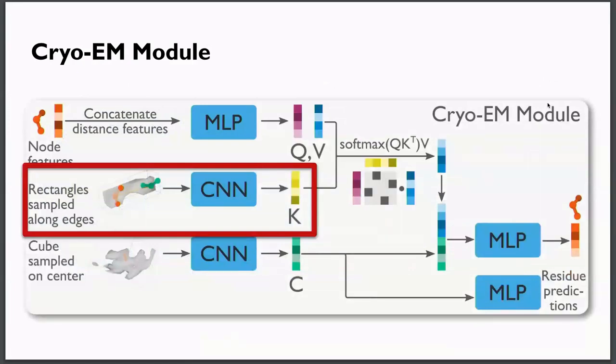And then we also want to know information about whether residues connect to each other or not, because just from the output of the segmentation, all you have is a bunch of nodes in space and you don't know what connects to what or what the direction is and so on.